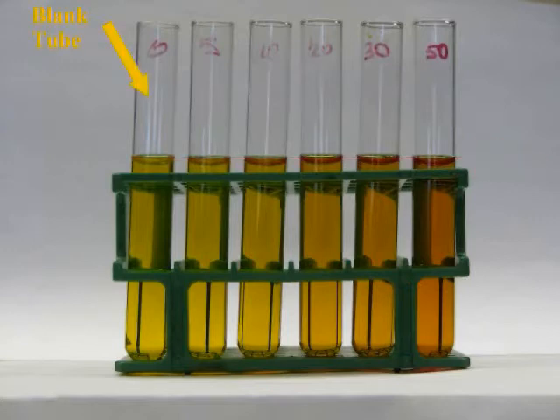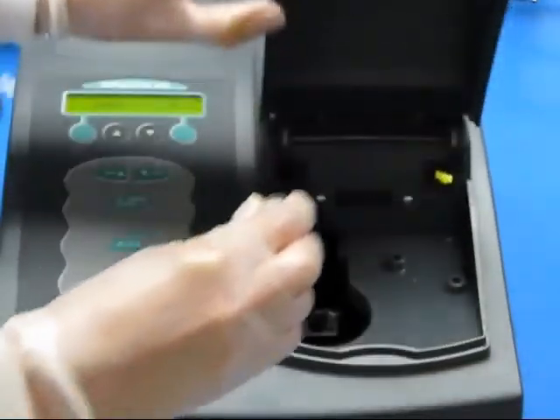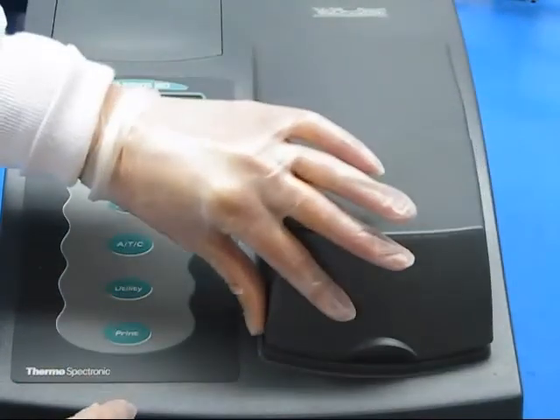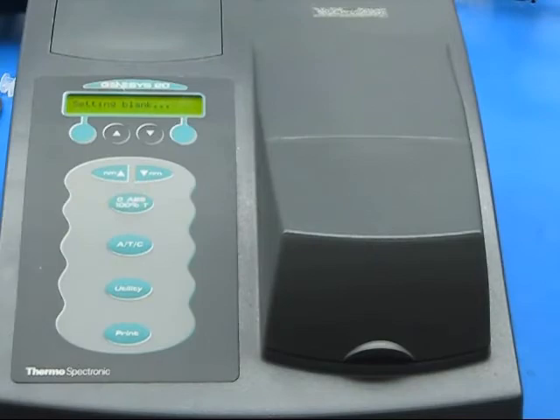Zero the spectrophotometer between each step using a blank. You will use the same blank throughout the entire lab, so do not discard it between experiments. Wipe all test tubes clean with a Kimwipe before inserting them into the spectrophotometer. Do not discard any of your tubes until you have produced an acceptable curve.